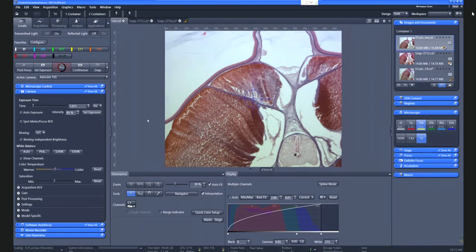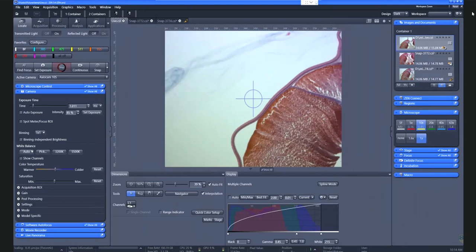With a sample like this, we want to make sure to have a very decent, very white background because there is no staining in this position here. There is no color to be expected. So that's why we have the option of this white balance, kind of a white reference. Your smartphone is doing this all the time. But here, as you can already see, this sample is showing more red than green and blue, so maybe it's worth to set a kind of a white balance.